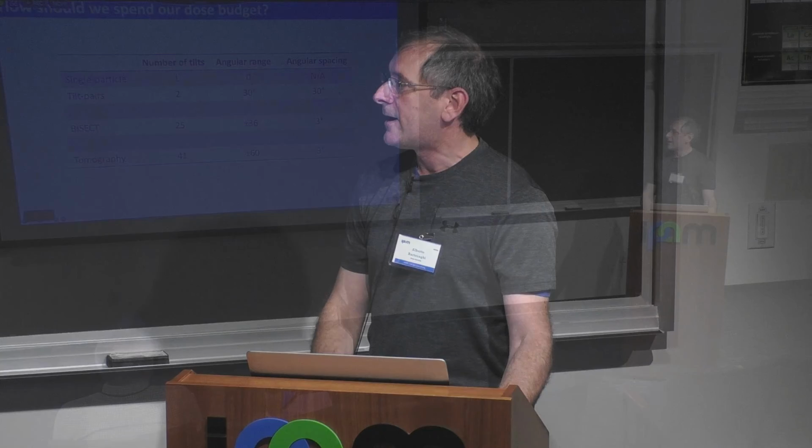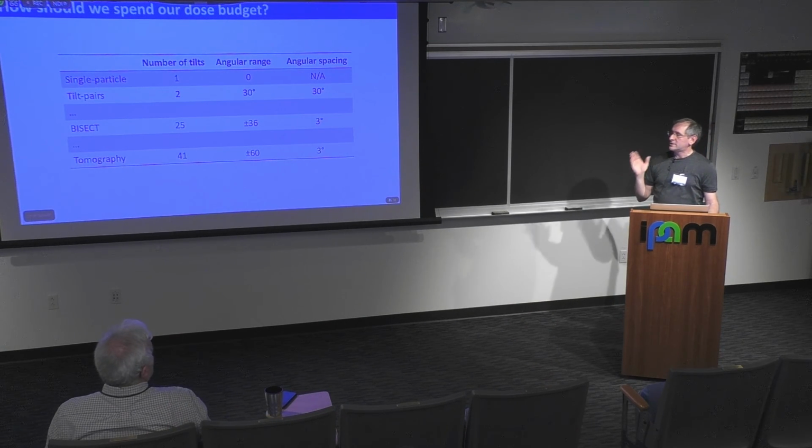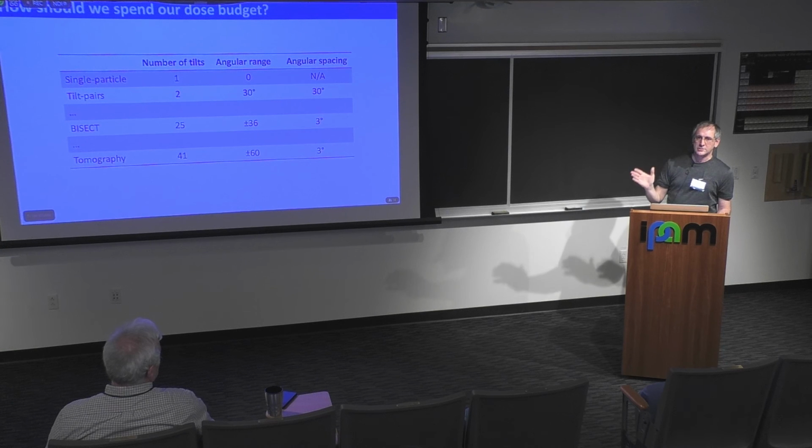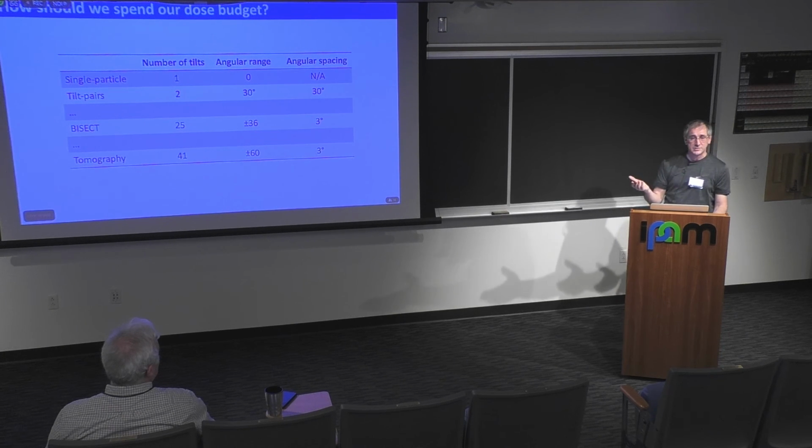So you can essentially decide how many images you want, and the tools are ready to get you enough data and analyze it to get you a high resolution structure. In practice, different projects may require different schemes, but having these tools available is one of the important contributions of this work.